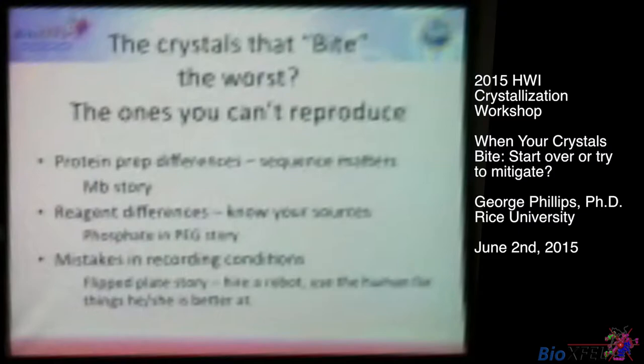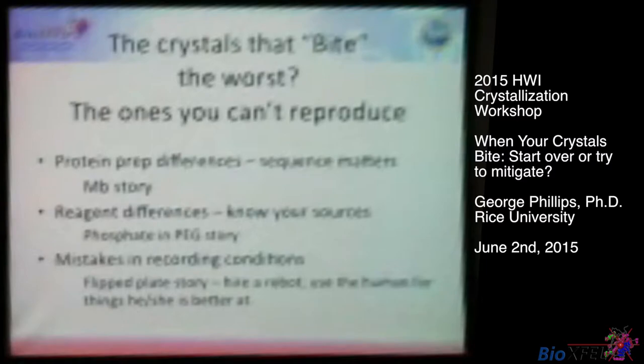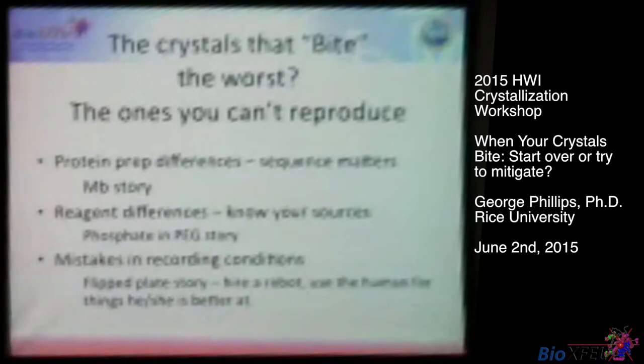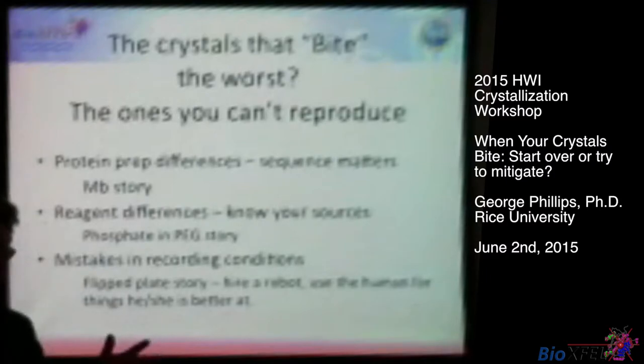Not that the genetic material is that interesting a concept, but another famous crystallographer tried for years and couldn't get crystals of this recombinant protein from a synthetic gene. He was trying the classic recipes from Kendrew and others and wasn't able to reproduce it. The biochemist, I pronounced him incompetent, but he's not incompetent. He's a very highly accomplished crystallographer. He gave it to me to try, and instead of trying the standard recipe, I screened it, and I got a completely different crystal form. And I couldn't reproduce the original form either.